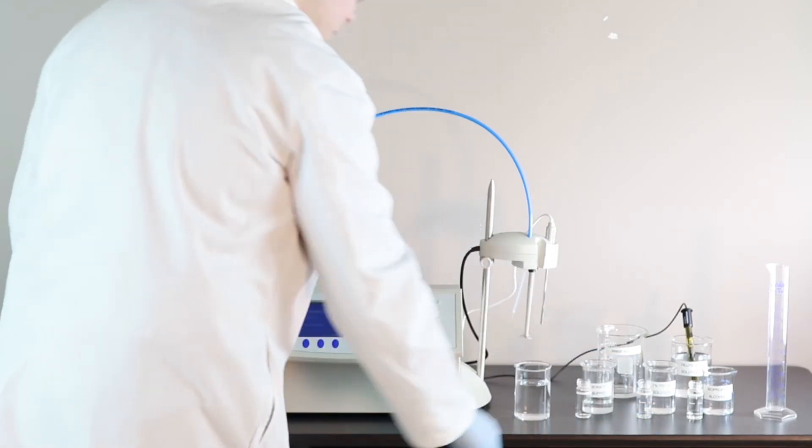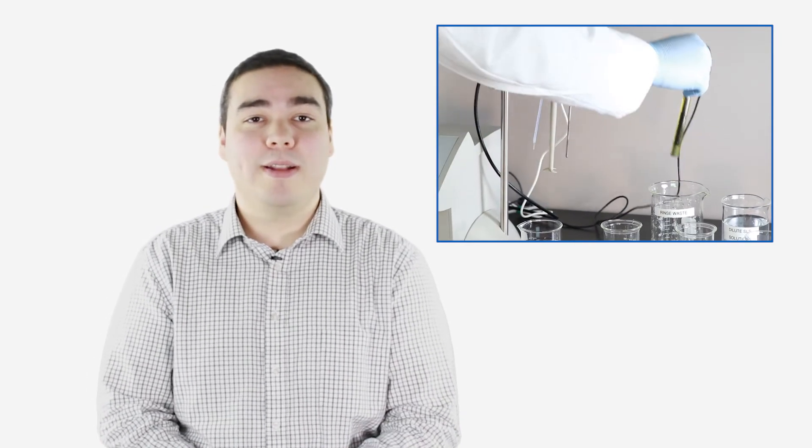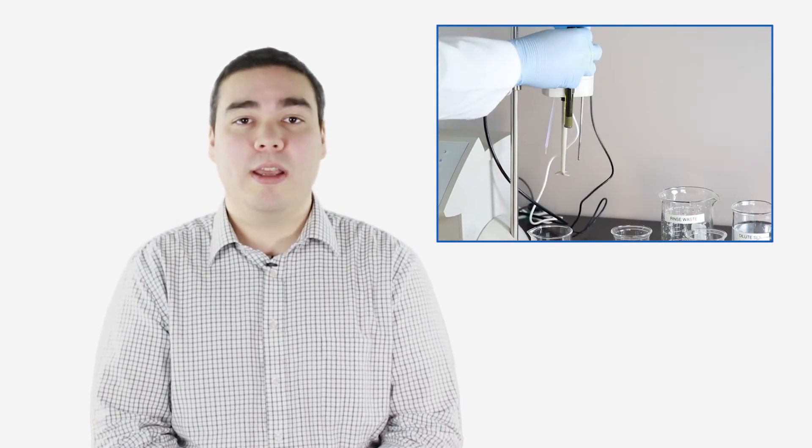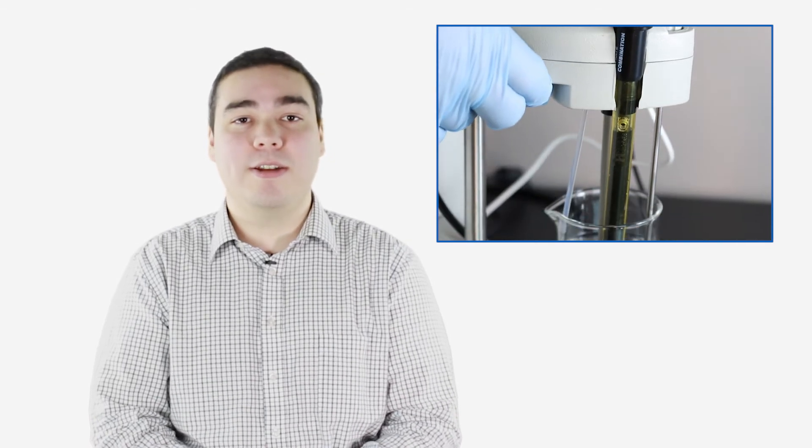While preparing the sample, it's good practice to soak the electrode in a dilute sodium lauryl sulfate solution to help improve the electrode response. I'll rinse it off with some water, place the electrode in the holder, and lower the electrode and stirrer into our sample beaker.